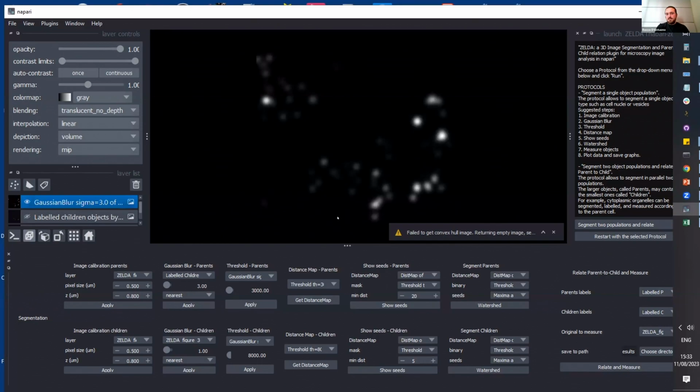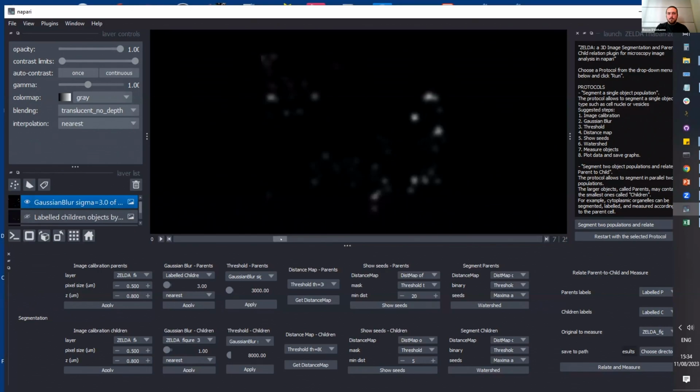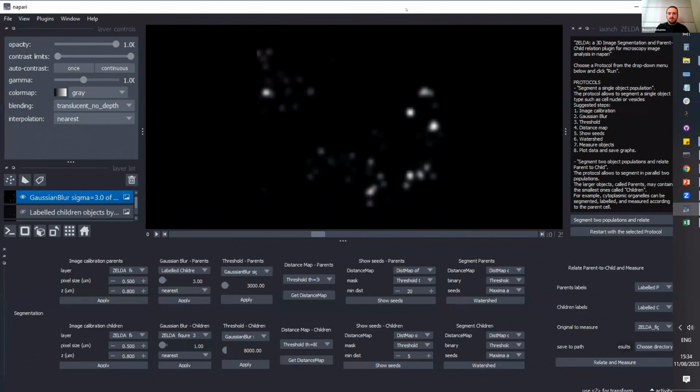So if I visualize it in 2D here, I'll be able to see what the result is. Let me see if I can visualize. So you see this label probably was 15, or 16, and because of the Gaussian filter, it starts to take values that include decimals. So it doesn't really make sense, but there is no limit. You can take whatever layer from here and process it with the same filter.